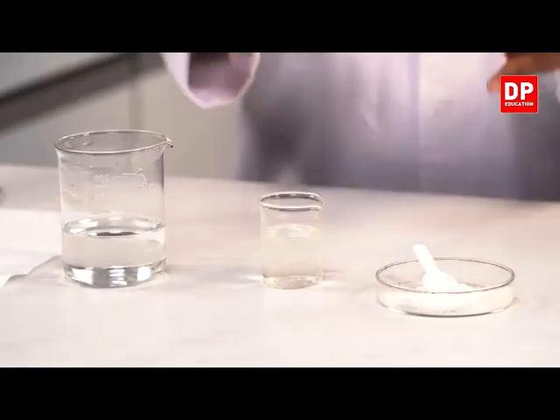So now you can see, students, the salt is completely dissolved in water, and what we need to observe is how the solution looks. You have to look at the clearness or transparency of the solution, as well as the composition of the solution. This is a colorless solution. You have to observe whether the transparency is uniform throughout, and after that we have to leave it aside for a few minutes, and then observe it.